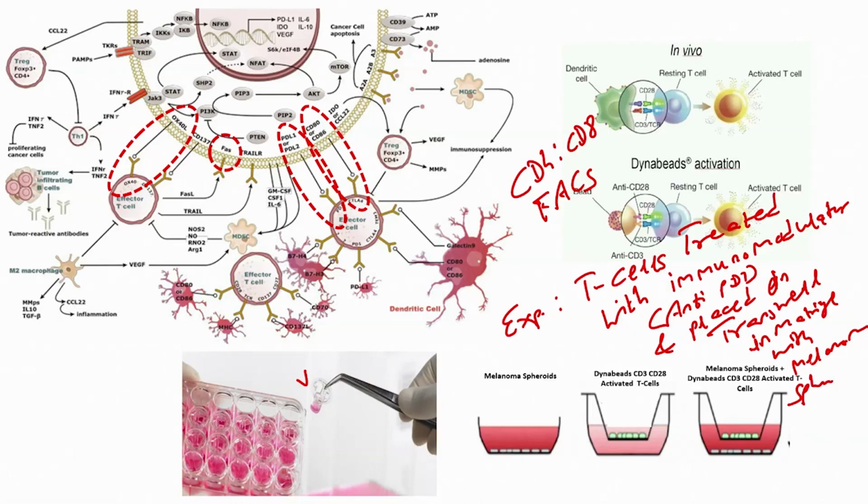Again, wait 24 or 48 hours and see the CD4 CD8 ratio.